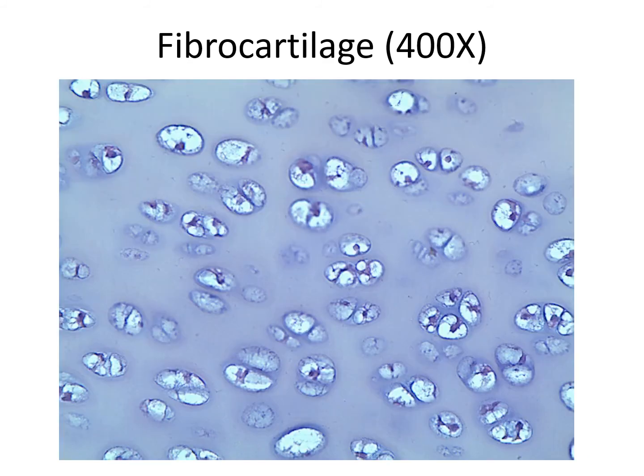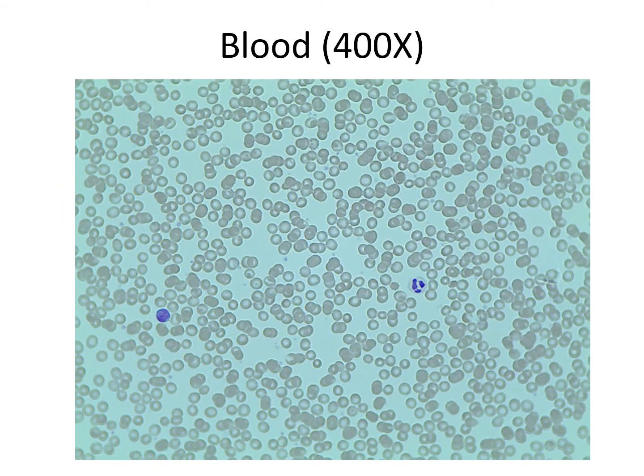And this is fibrocartilage. Actually, this slide is from Norca histology slides, and this cartilage looks a lot like hyaline cartilage. For you to tell the difference, you will not see perichondrium. No perichondrium, but you see this matrix over here. That's all matrix, with chondrocytes inside the lacuna. So, fibrocartilage. I'm reminding you that we have three types of cartilage: hyaline cartilage, elastic, and fibrocartilage.